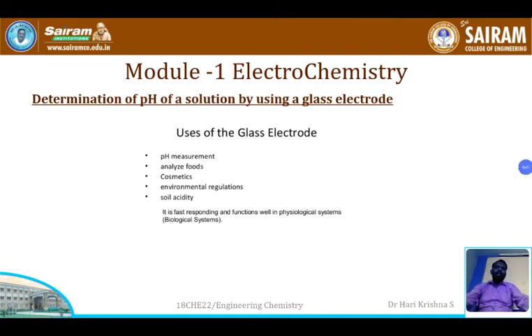Good morning. In our previous session, we discussed ion selective electrodes and the construction and working of the glass electrode. Right. So, ion selective electrodes. What do you mean by ion selective electrodes? We have discussed the glass electrode too.